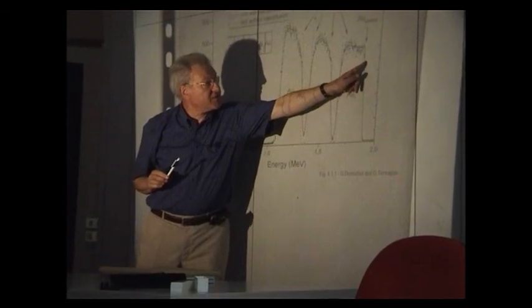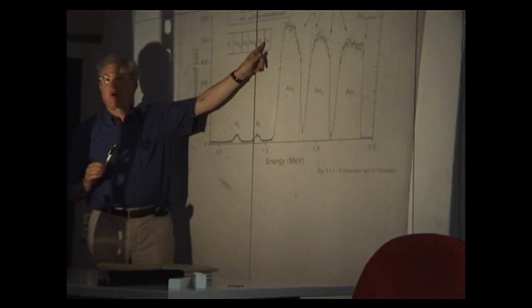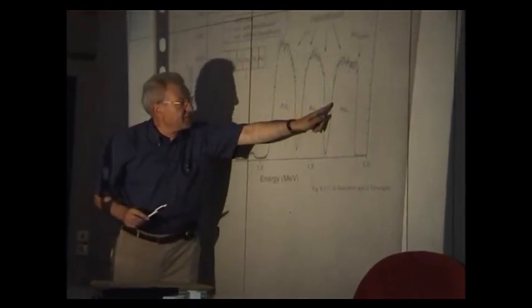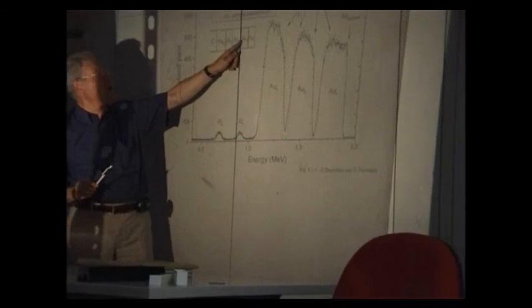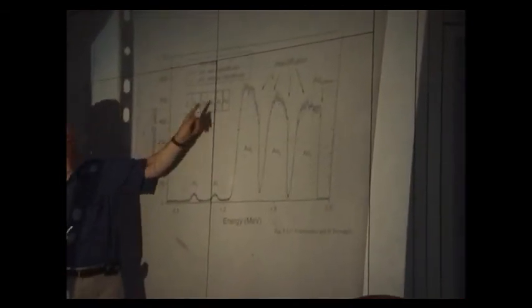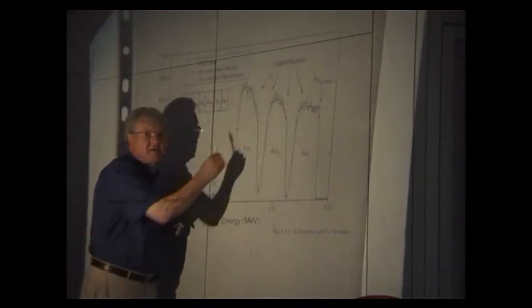That is the surface of gold, the last layer of the first gold coating. Then we have nothing here because we have no gold, and the signal we have here is the signal produced by the scattering of the second interface of gold. But you see that some signal is missing in those regions. It is because we have some diffusion of gold in aluminium or aluminium in gold.